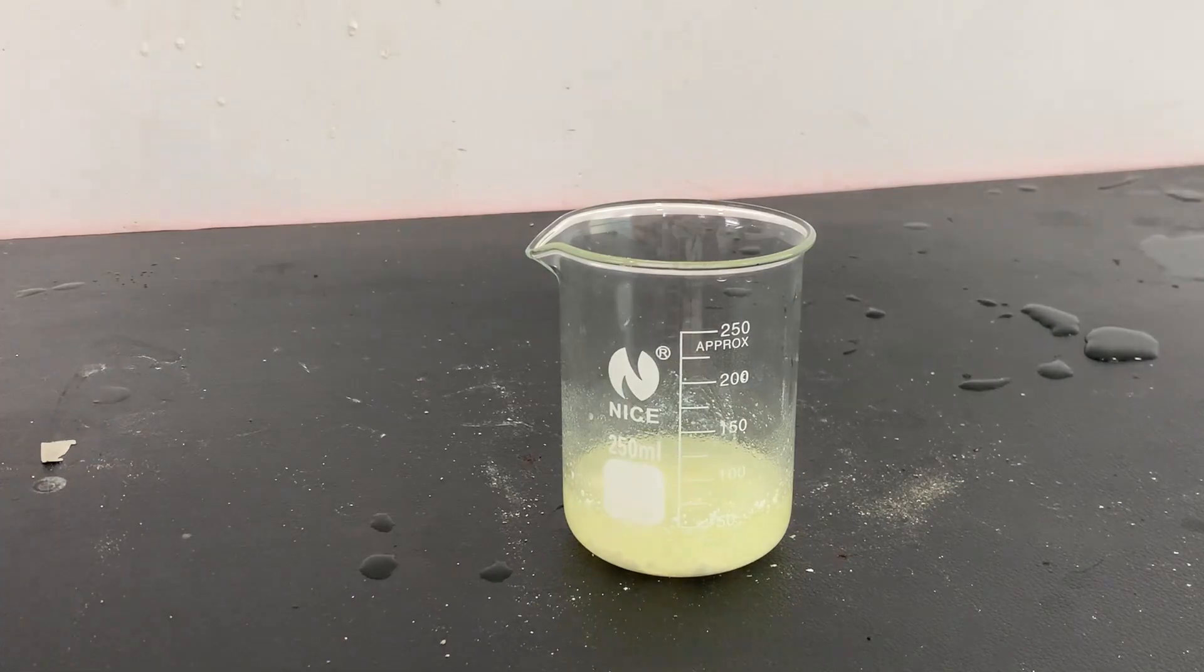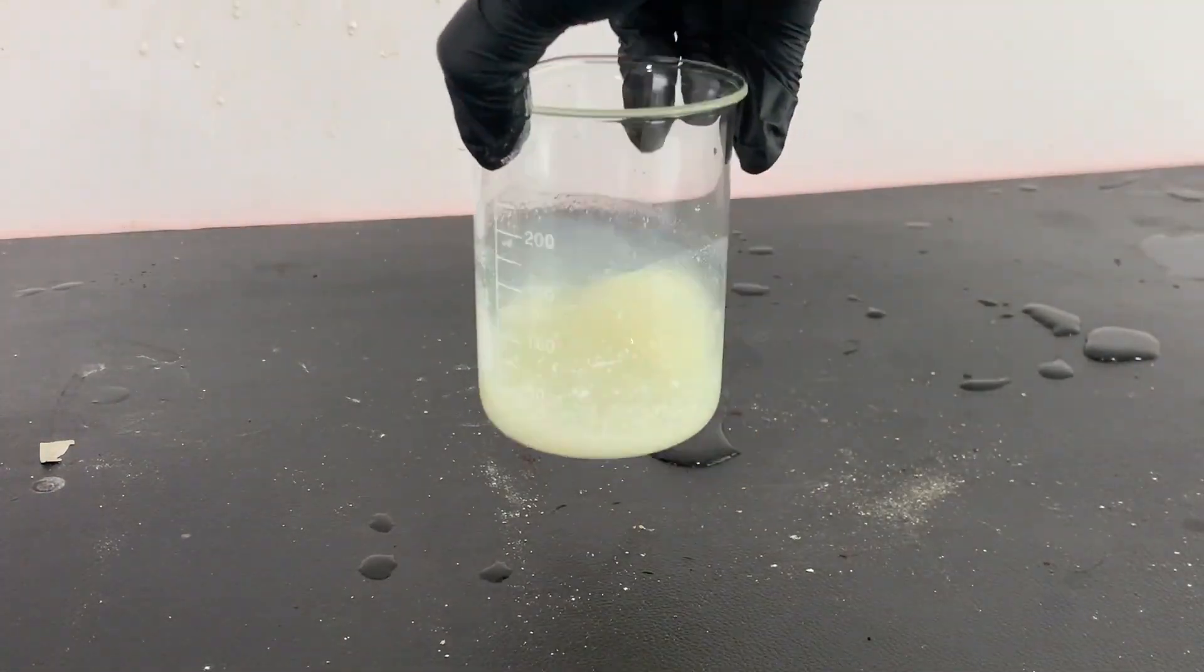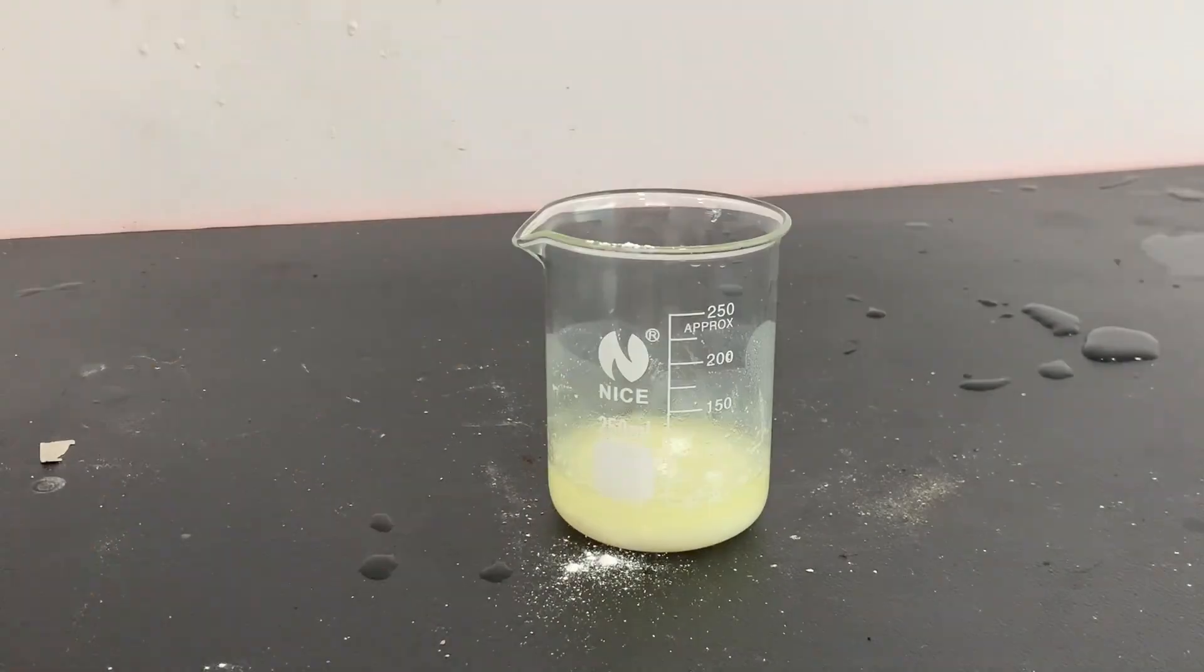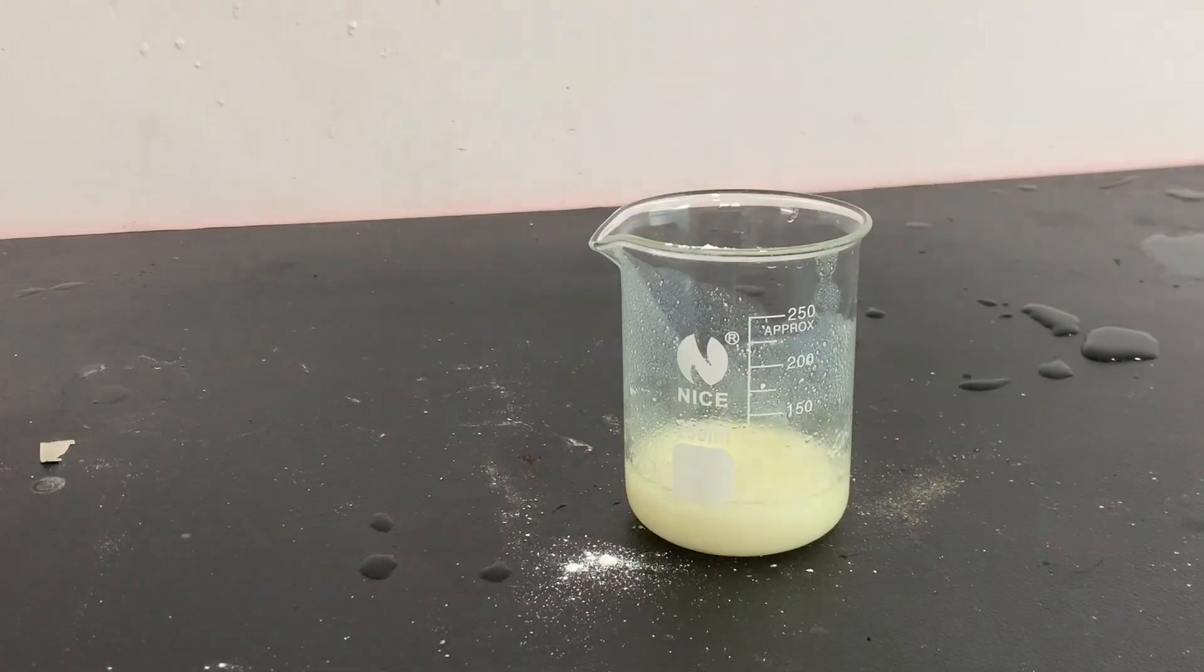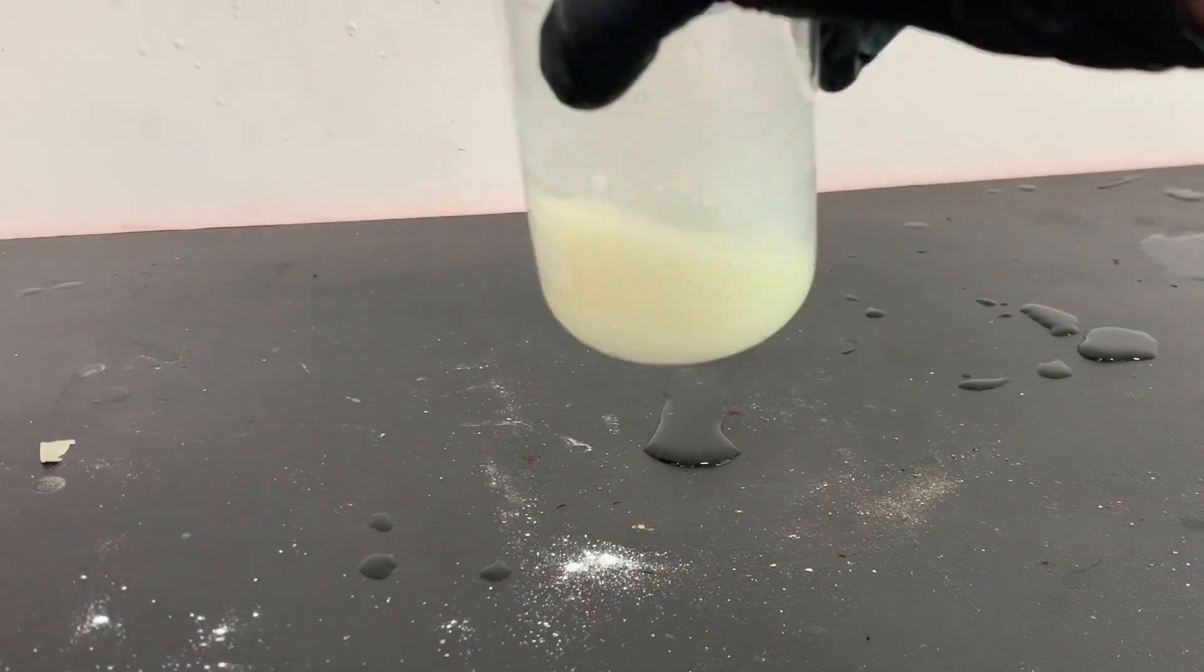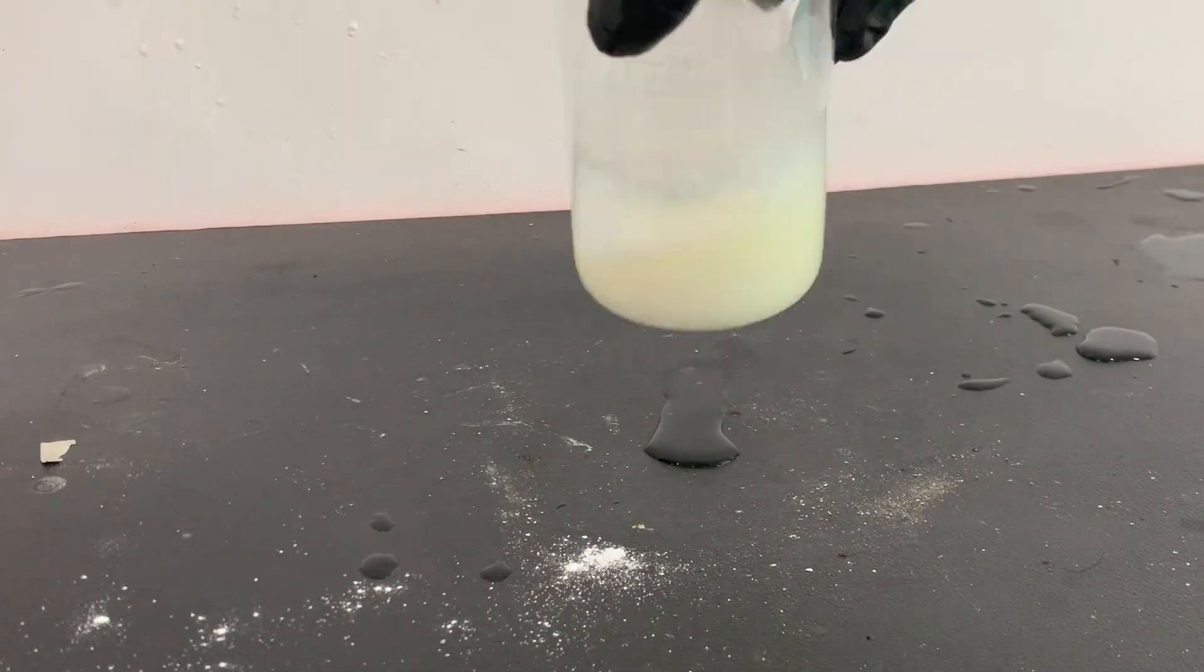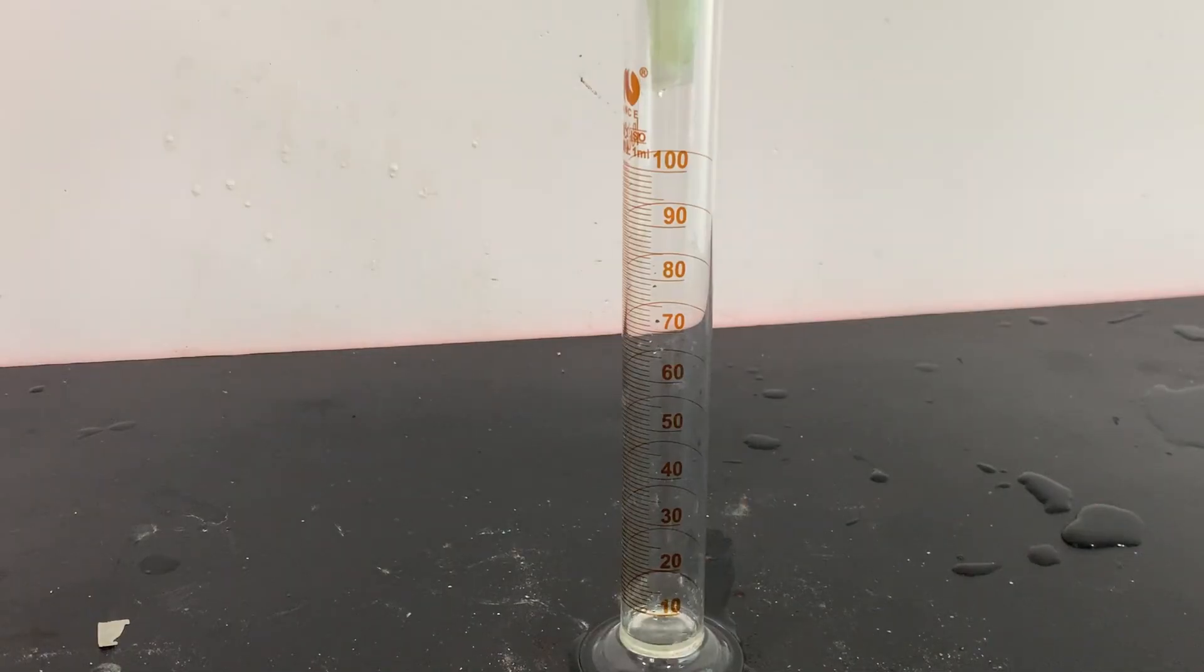The nitrobenzene was then dried with some anhydrous magnesium sulfate. Ideally, only 2-3 spatulafuls of anhydrous magnesium sulfate would be needed, but as you can see in the clip, I added more than that which caused a low yield. As most of the magnesium sulfate absorbed the nitrobenzene, it made it harder to filter through.